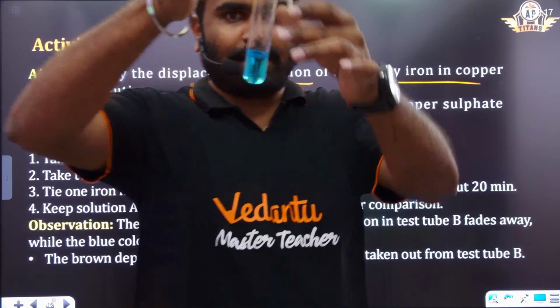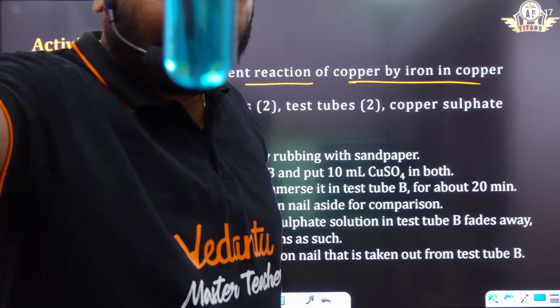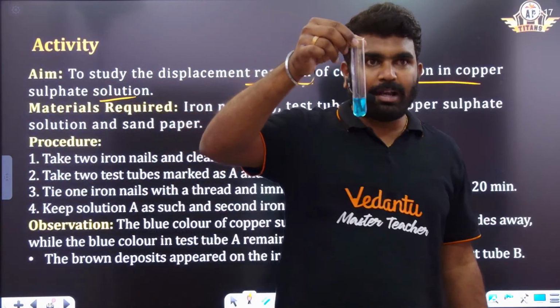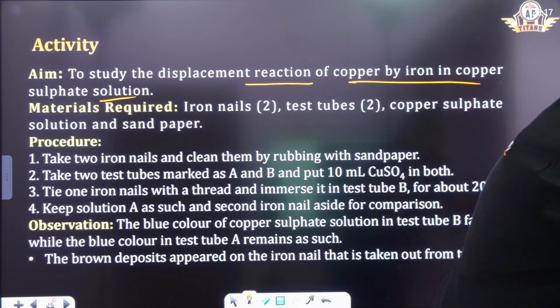You can see the reaction is happening here. Okay, we'll see after some time. So let me explain the activity now.